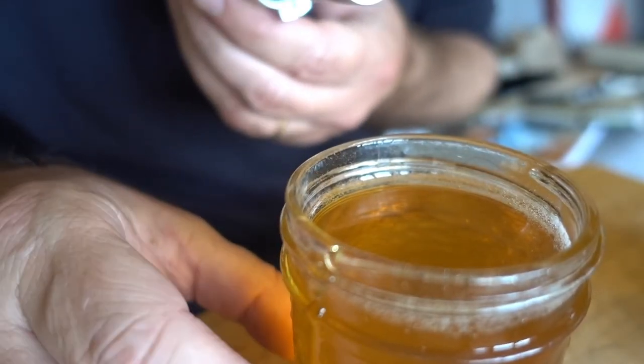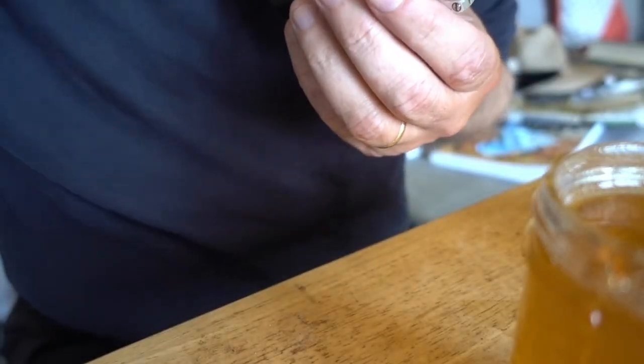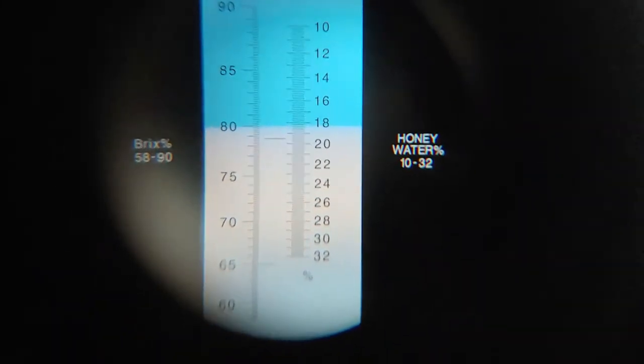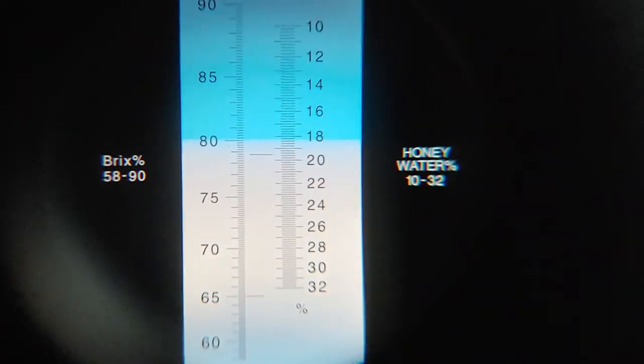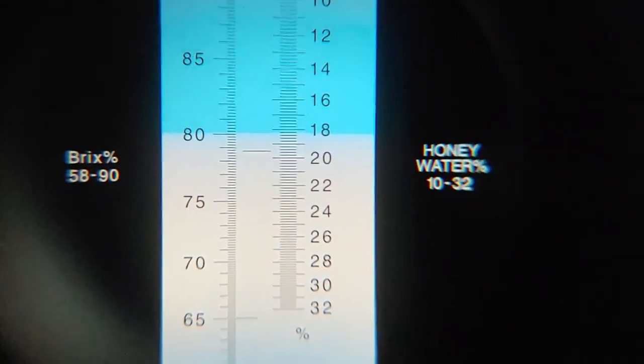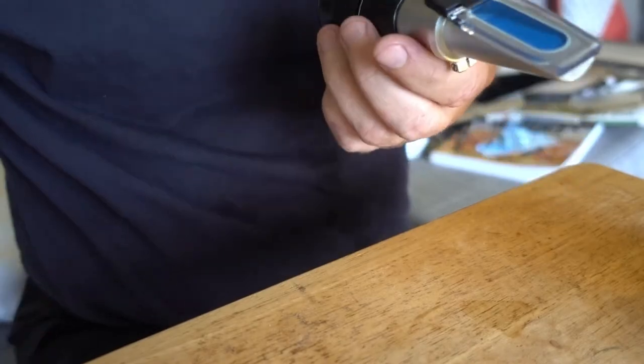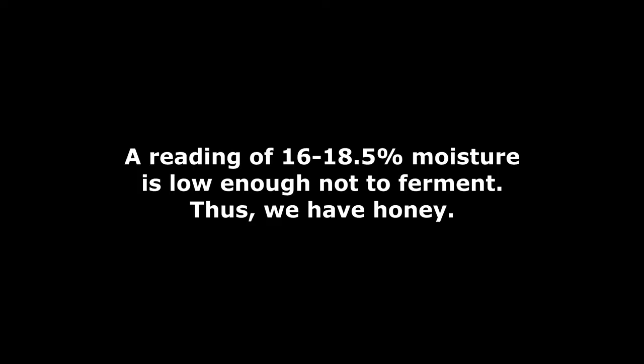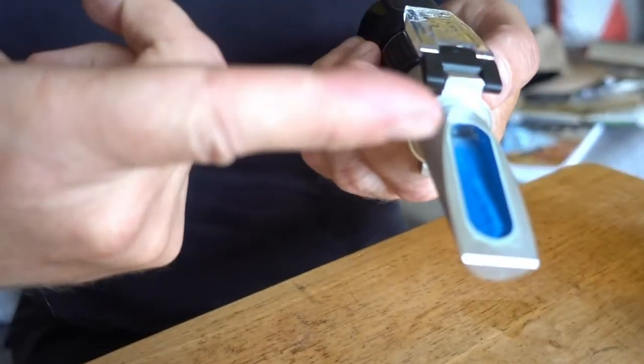So this is some honey that I'm pretty sure isn't fully cured and I don't really care because it's still pretty tasty but let's just see. There we go, dead on 18, there it is right there, a little over 18 so that's still well within the range of acceptable honey. So this thing's working.